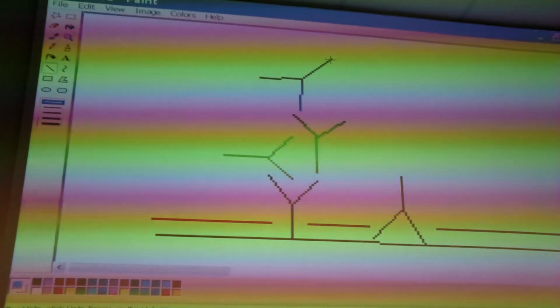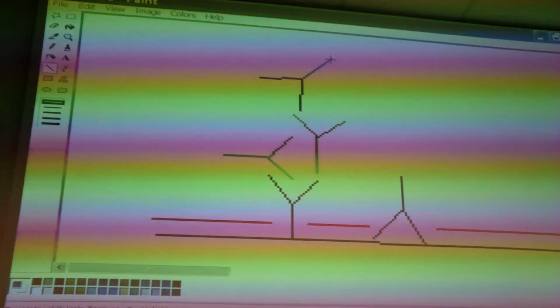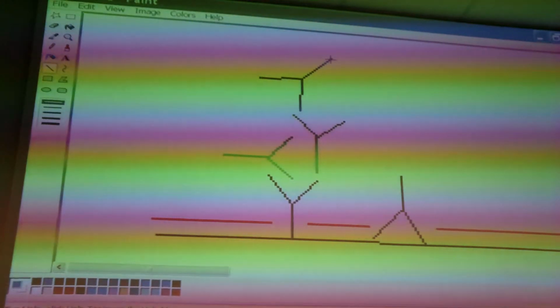Okay, so how are we going to find if the blue antibody is bound? How are we going to detect it? Fluorescent probe. Fluorescence, okay. Is an ELISA typically used with fluorescence? We also use enzymes. You need an enzyme, right? So what kind of enzyme would you typically use in an ELISA? Horseradish peroxidase. Yeah, that's the one that we are going to use.